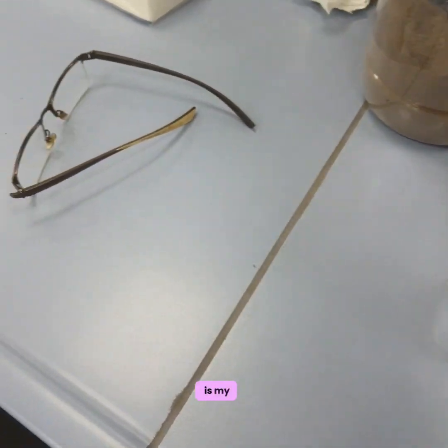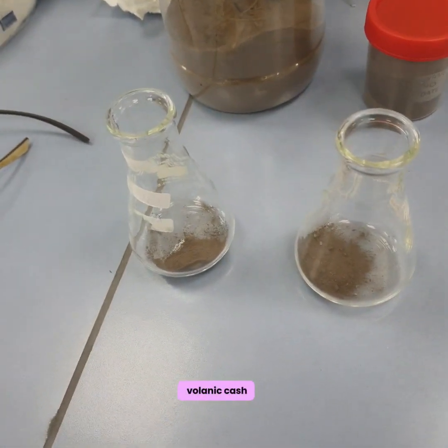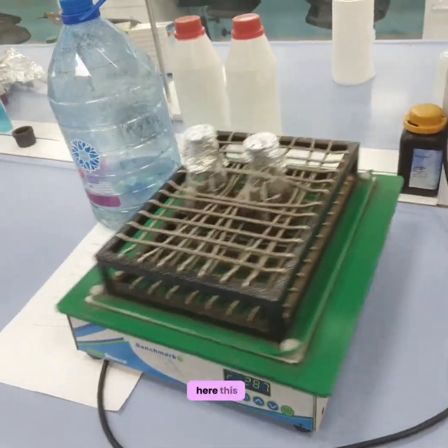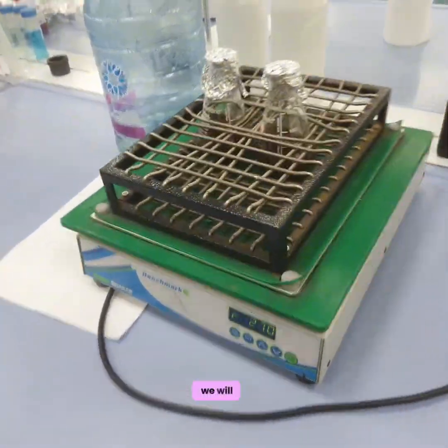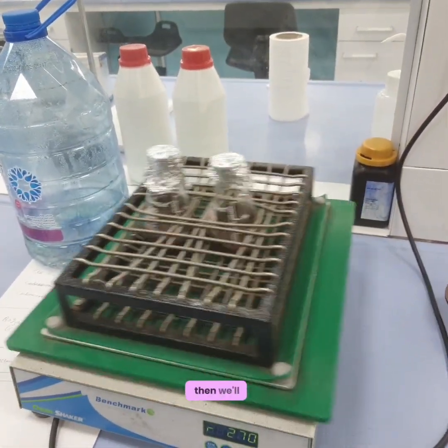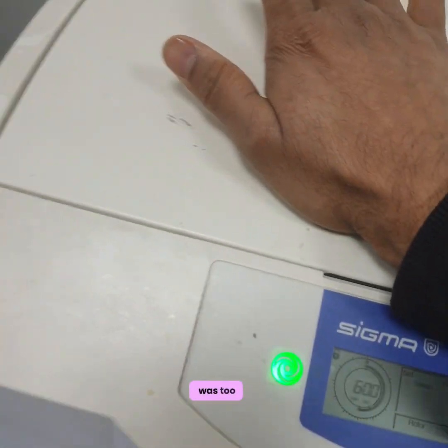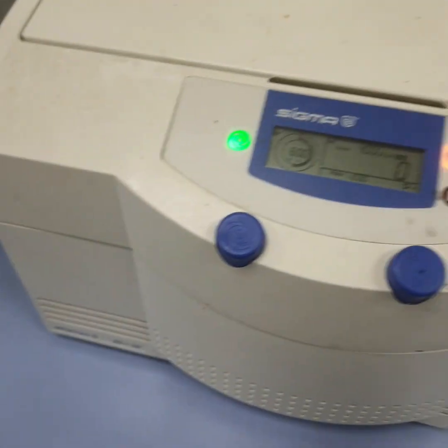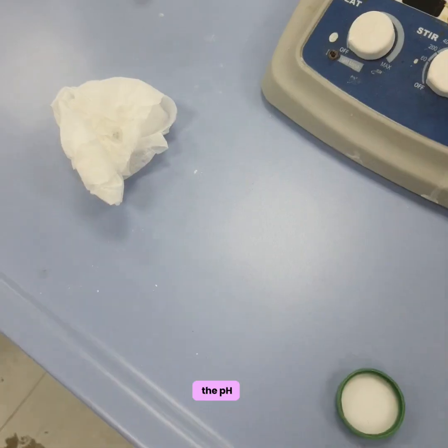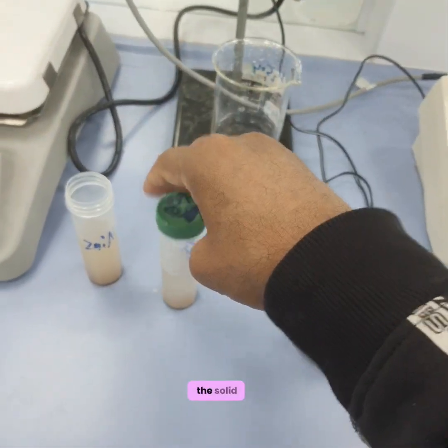So this one is my raw volcanic ash, and this one is my base activated volcanic ash. Now we will transfer water and shake for a few minutes. Bring it here. This is the orbital shaker, and then we will take it out and wait for a few seconds so that the solid particles settle down. Then we will measure the pH. I'm centrifuging the sample because it was too thick and viscous, and after that we'll compute the pH. Now after centrifugation, you can see the samples have been separated from the solid.